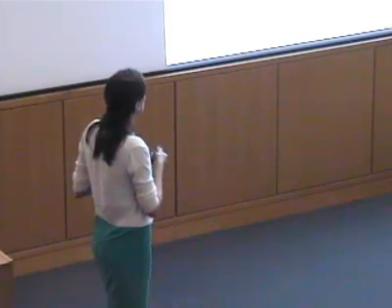This is the actual EXAFS signal. And now quite a few things have changed about it. We're no longer in energy space. When you look at EXAFS in most publications, you're in k space, which has units of reciprocal angstroms. Okay? Now, in order to get to k space, we have to define a point E0 in energy space. This point E0 is the start of your EXAFS, the k equals 0 point, or the point at which that photoelectron has been ejected to the continuum and can interact with its neighbors.